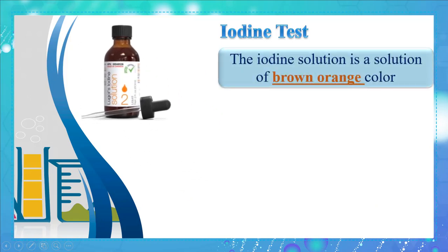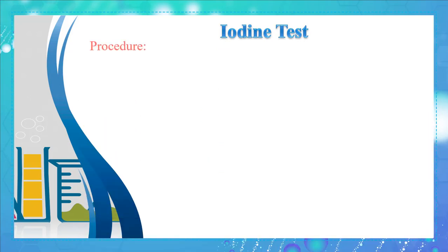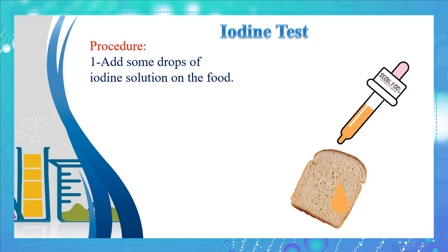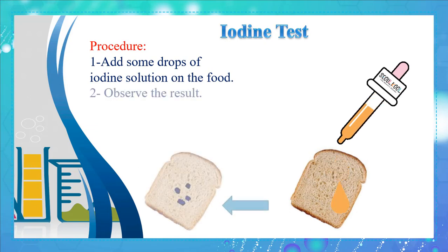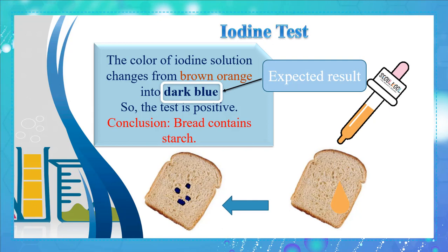We will start with the iodine test. The iodine solution is a brown-orange color. The type of food identified in this test is starch. Procedure: add some drops of iodine solution on the food and observe the result. The color changes from brown-orange into dark blue. Dark blue is the expected result, so the test is positive and we conclude that bread contains starch.